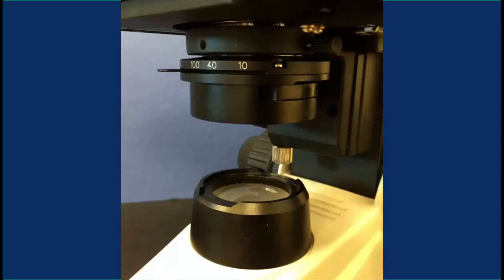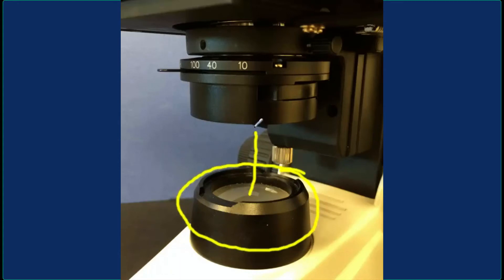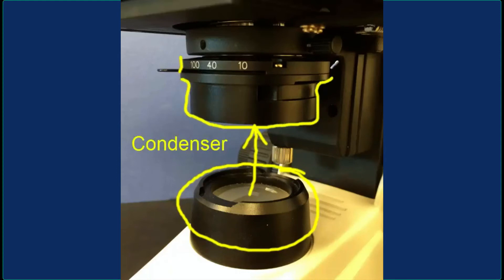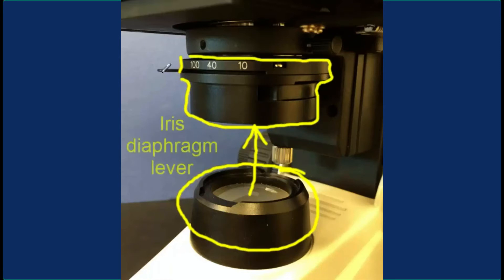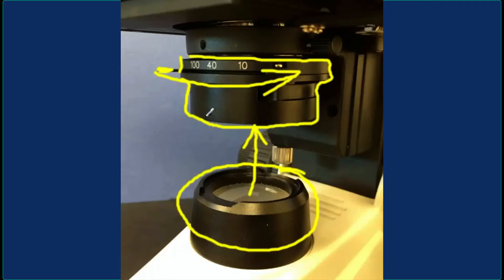Here is a close-up view of the light source, the condenser, and the diaphragm lever that controls the amount of light going through the condenser. The light goes up into the condenser lens, and you can see the lever which can be pulled in one direction. When you pull it, the amount of light going through the condenser and through your specimen decreases, but you'll see an increase in contrast. You typically reduce the light when you have a poorly stained slide and want to increase contrast because the stain isn't giving you the detail you want to see.